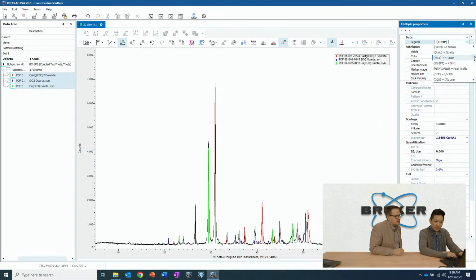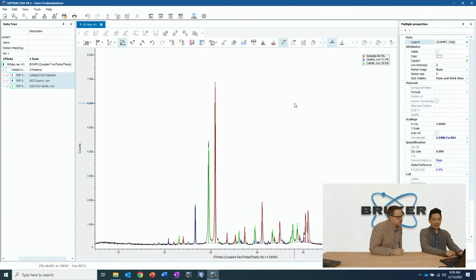There are a lot of different choices there. I think it is SQ. So curly bracket, SQ, curly bracket, and then if I click off to the side, you'll see that it is. Oh wow! That cleans it up right away.